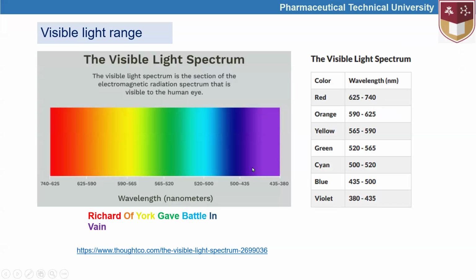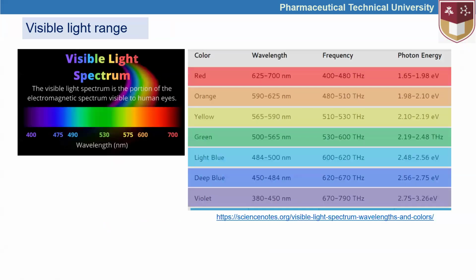It depends on the different capacity of seeing colors in different people. These capacities differ, that's why we can see some discrepancies, but they are not very significant. Okay, next.